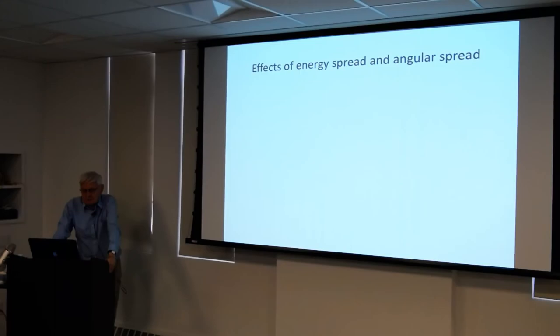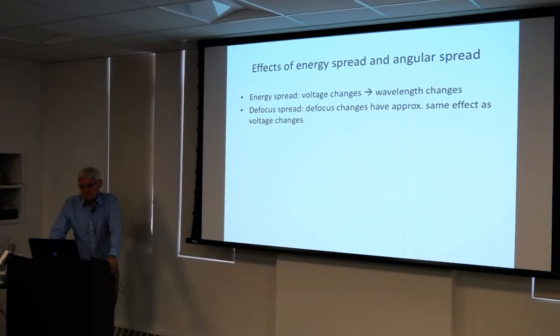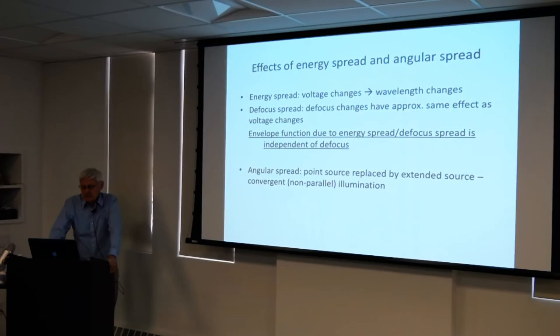So the energy spread. I'm talking about an actual physical microscope, which doesn't have one constant energy, but rather it has fluctuations. These come from voltage changes, and they produce wavelength changes. And the defocus changes have approximately the same effect as voltage changes. They can be expressed in the same way. So we get an envelope function due to energy spread or defocus spread. And this is independent of defocus.